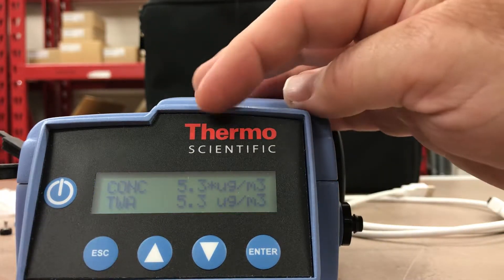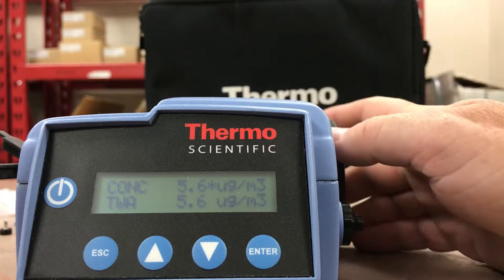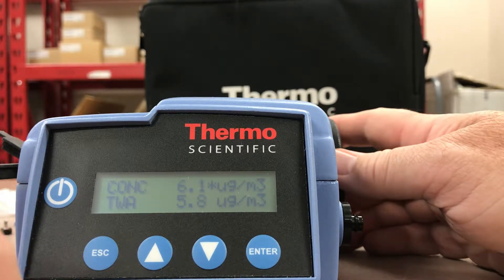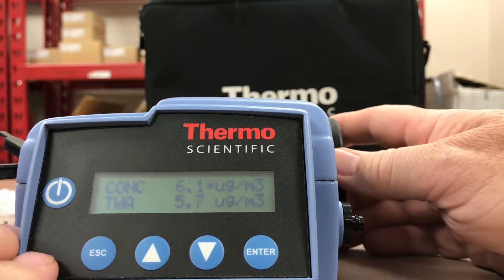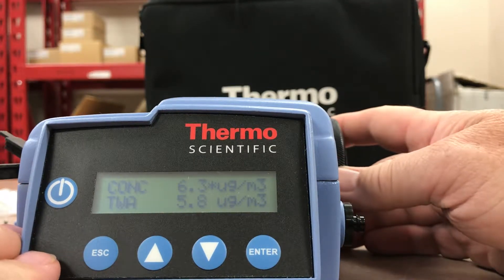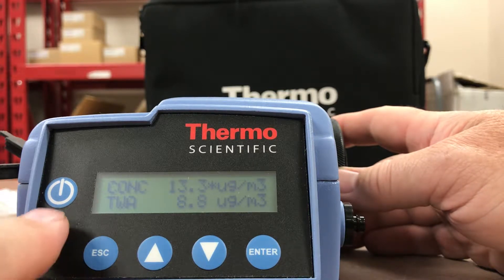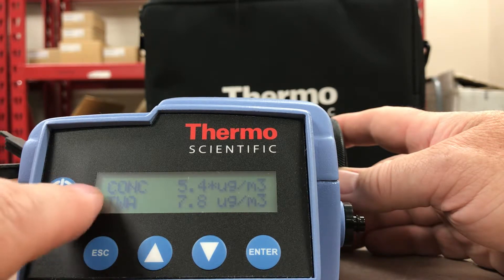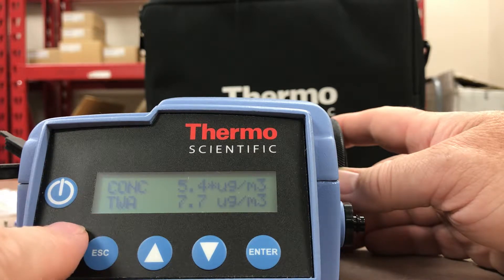You'll see it's reading 5.3 micrograms per cubic meter on the concentration — the real-time output. It's a great unit for portability to walk around indoors or outdoors, and it has data logging ability. It comes with software you can load onto your laptop to download the data into a spreadsheet and do real-time data graphing of micrograms per cubic meter in concentration or time weighted average.